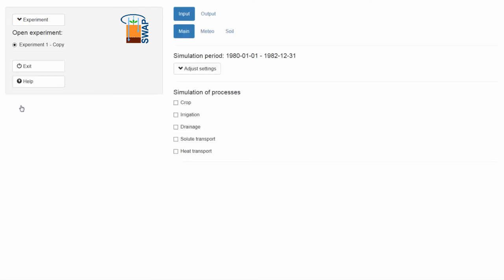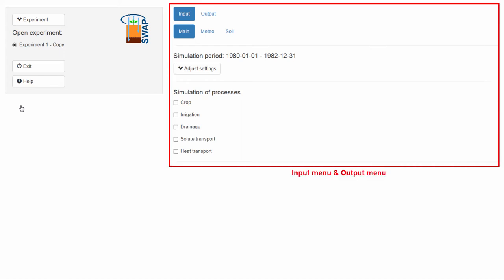After opening an experiment, the graphical interface changes. The input and output menu appears on the right side of the screen. These menus are further explained in their own clips.